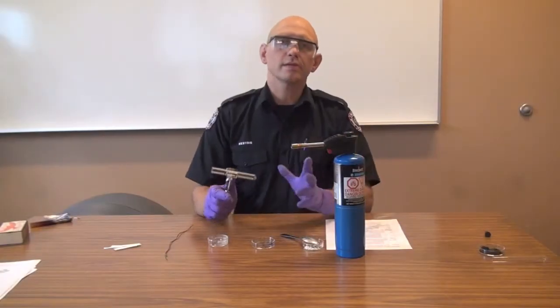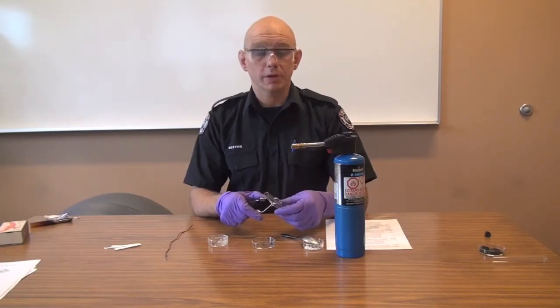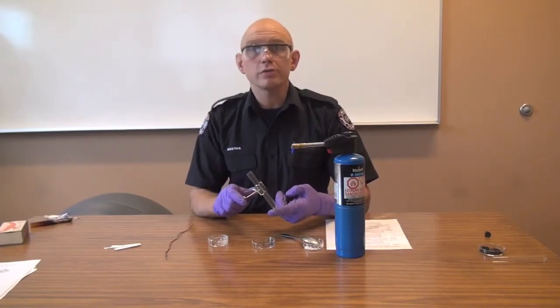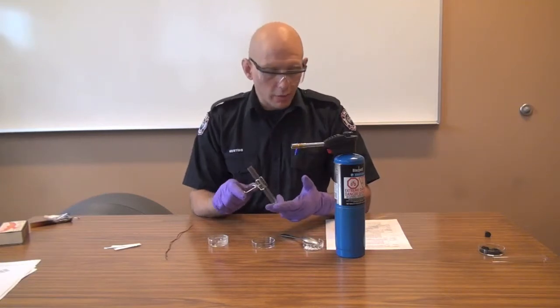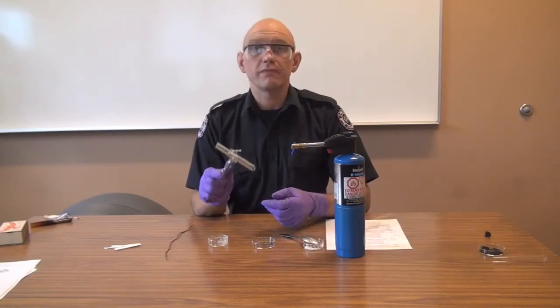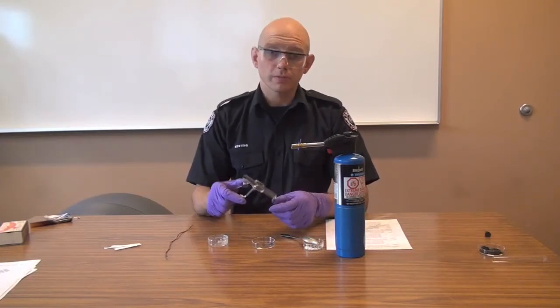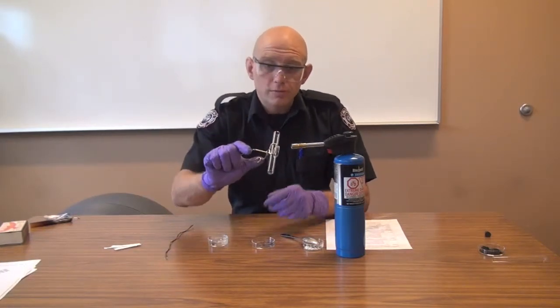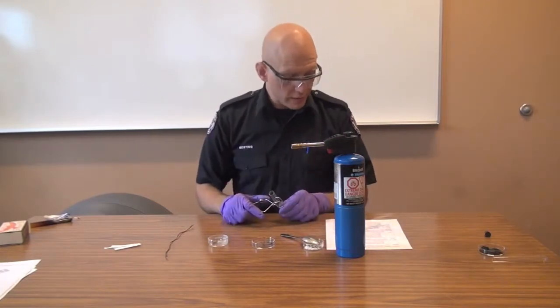The next test is a flame test. This is where we try and burn the substance itself — or rather, burn the vapors coming off of it. Always do your peroxide test, your oxidizer test, your hot wire test, and your hot tube test before you do this test, because you don't want to be doing this with an explosive, and you don't want to be pointing this tube at yourself — it's going to shoot out and hit you in the eye.